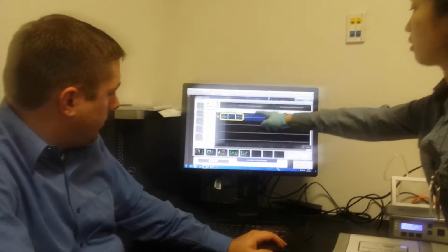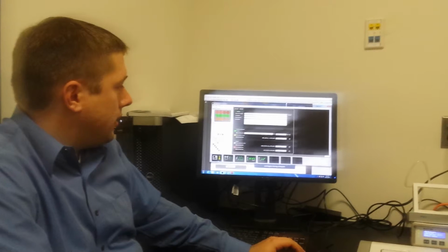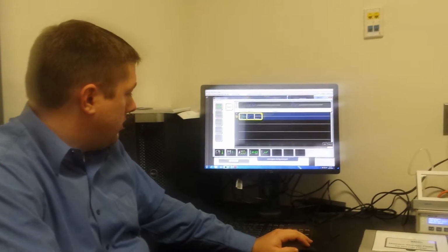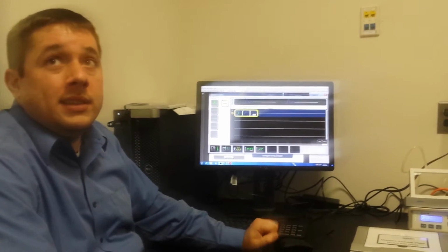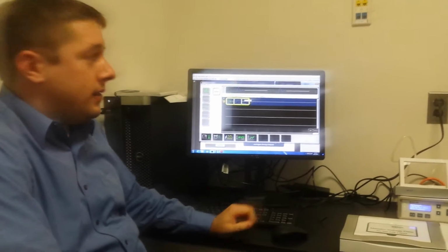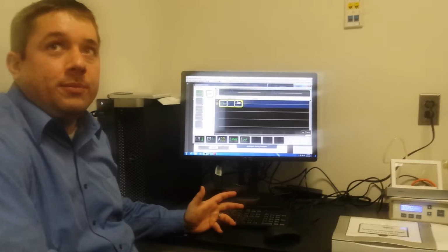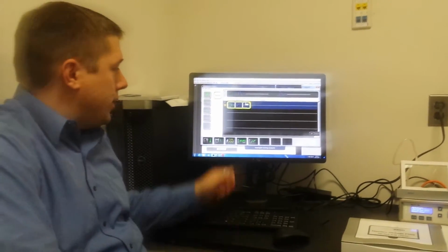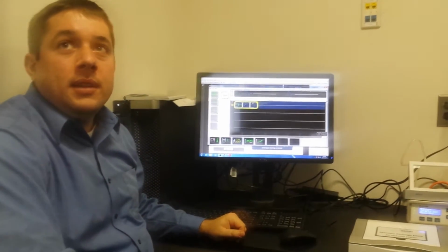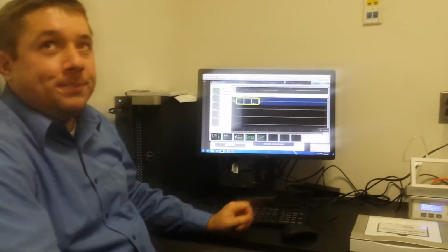So how do we put in an arbitrary waveform? Sorry to interrupt. Can we import a CSV file or an Excel file of data? What have you built in here right now? Right now it's just step functions and sine waves. We also don't have a ramp function currently built in. So you'd have to do monophasic short pulses, stepping itself up. Kind of a pain to build, so definitely save that once it's done.